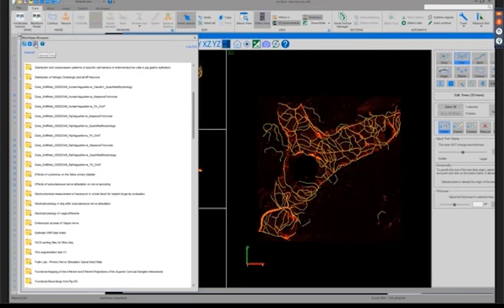So we would recommend, if you're going to use this tool, that you go to Blackfynn and ensure that the BIDS structure of folders is set up for the data set that you'd like. And then as you finalize data through MBF software, you can navigate to that file and upload it. It does not have to be an MBF file. It can be any type of data. Andrew made a good point here. It should be the Blackfynn platform, not Blackfynn portal. So we will address that immediately. That's true, because the portal is a very distinct location for the public access of all of the data. So we want to keep that explicit. So that's a good point.